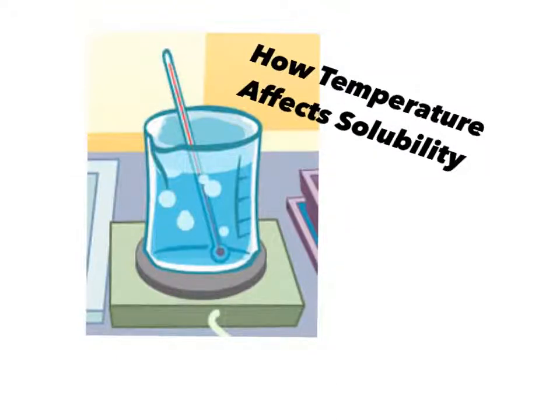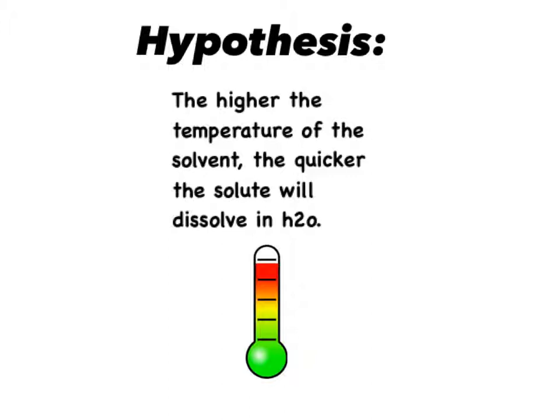Our lab is about how temperature affects solubility, by Kimlee, Dara, and Maggie. Our hypothesis is that the higher the temperature of the solvent, the quicker the solute will dissolve in H2O.